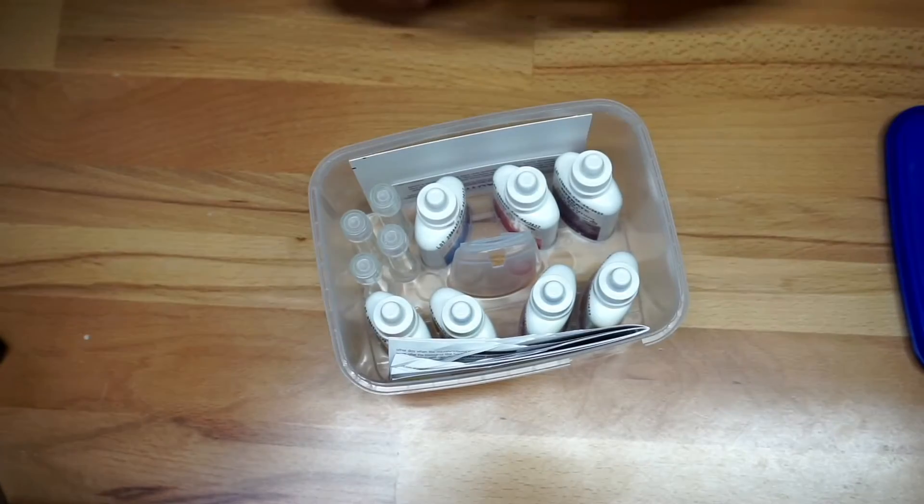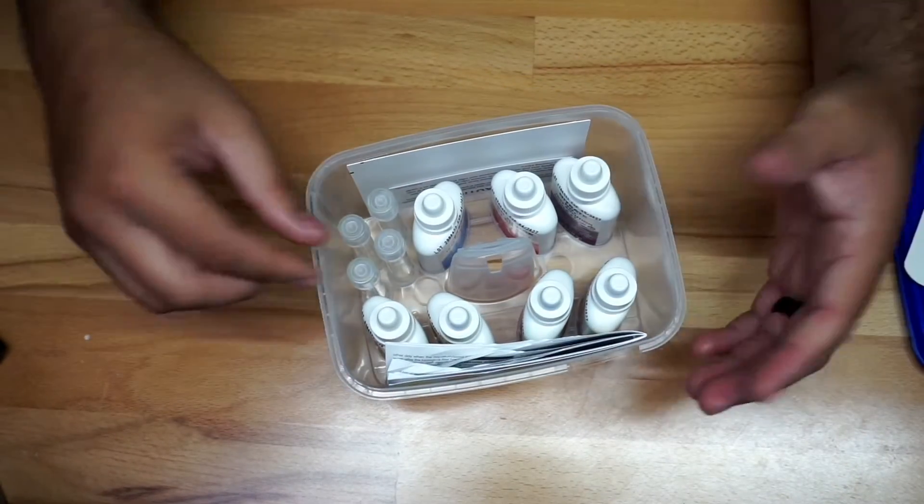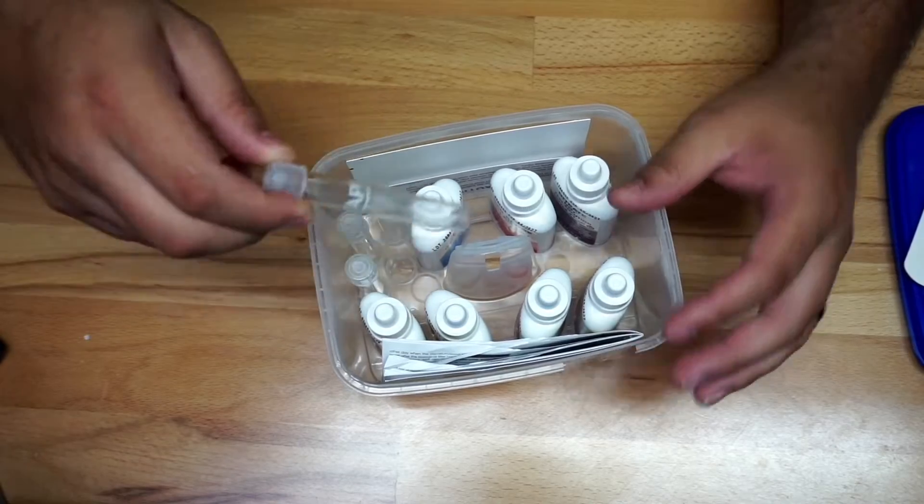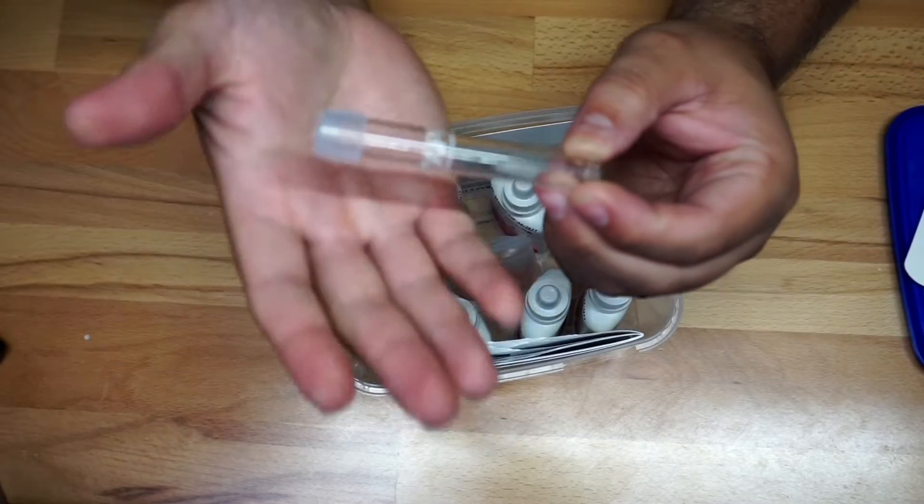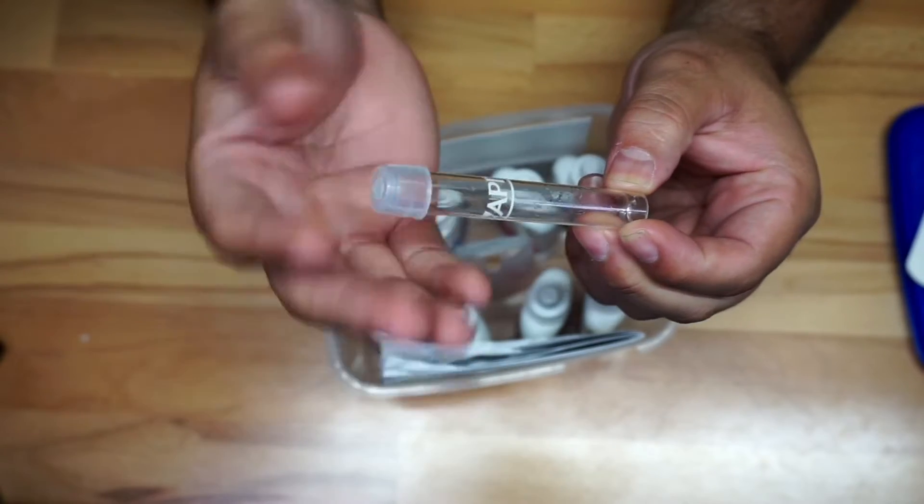Really nice. When you open this up here you're going to notice that you're going to have different bottles as well as testing tubes, so I'm going to take one of those tubes here to kind of show you. You can see it right here from API.